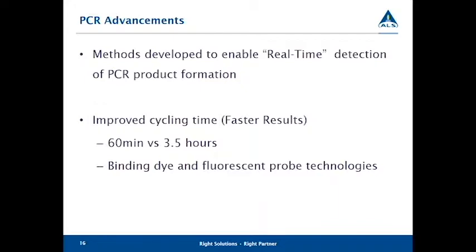And then once you combine the detection method of the fluorescence, you can actually take a measurement after each cycle and then have a real-time indication of whether the amplicon or target sequence is being amplified as the test progresses.